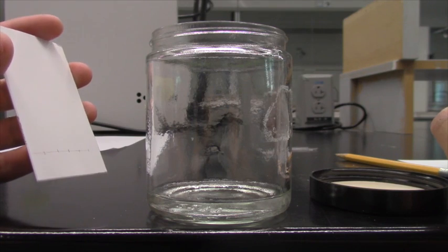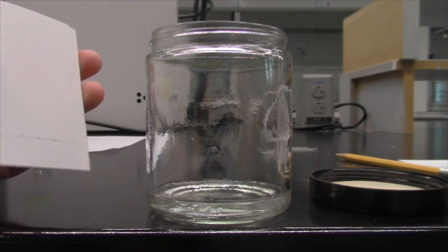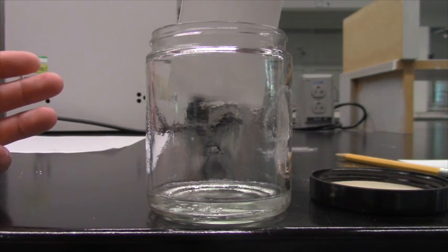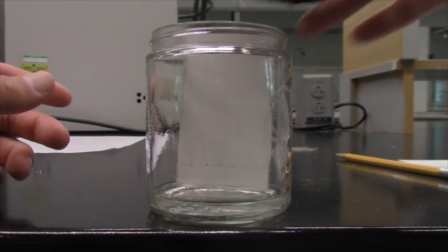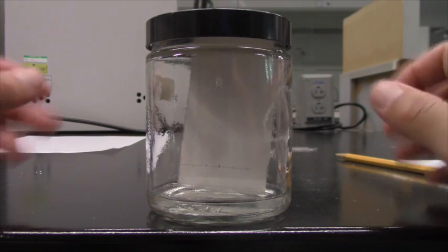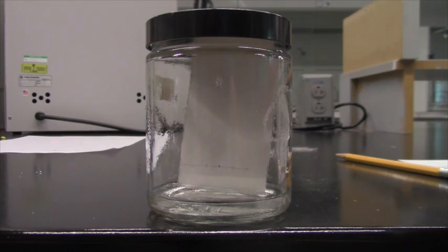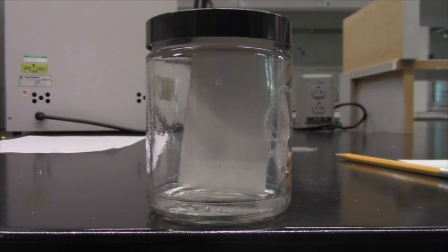So once my TLC plate has been spotted and my development chamber is ready to go, all I need to do is place the TLC plate gently into the jar, then cap the jar, and once you've got it capped, you just want to let it sit there. You don't want to disturb it at all. And we can already see the level of that solvent start to rise up the plate through capillary action. Now I'm going to speed up the video 20 times so that we will quickly get to the end point.